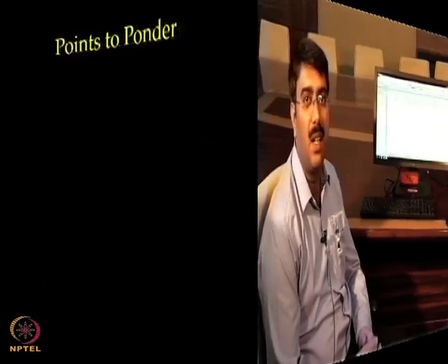Now we successfully demonstrated the protein-protein interaction here with protein A and the mouse monoclonal antibodies we used, and we got very good data with the 1:1 binding model, with the affinity around the 1.7 nanomolar range. So with this I am concluding my demonstration.